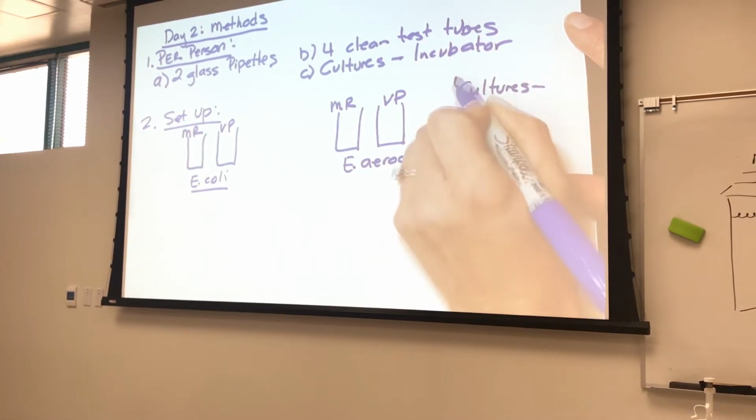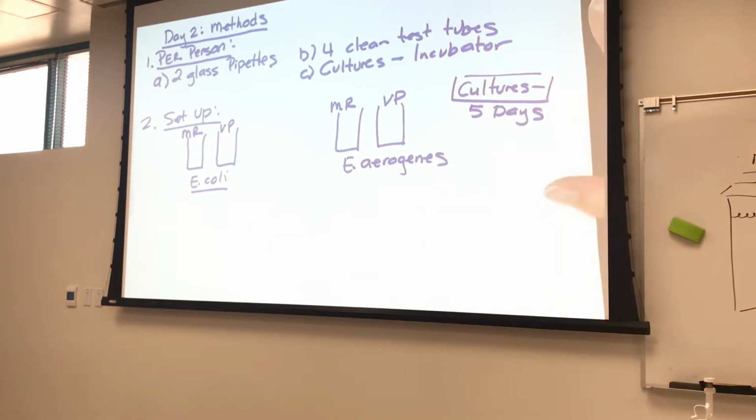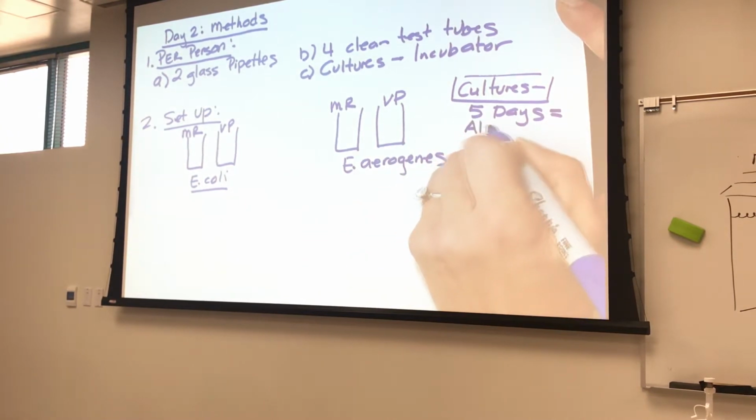They've been sitting in the incubator for 5 days. 5 days is a good amount of time, a little abnormal for us. The reason why it's so long is because we want to give enough time for the alcohol pathway.